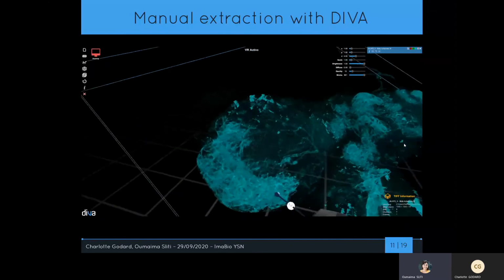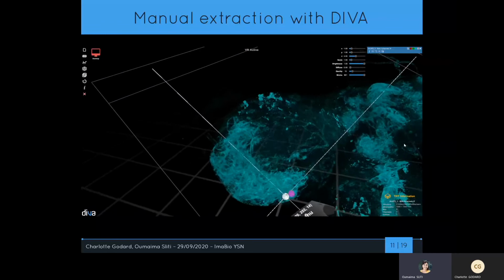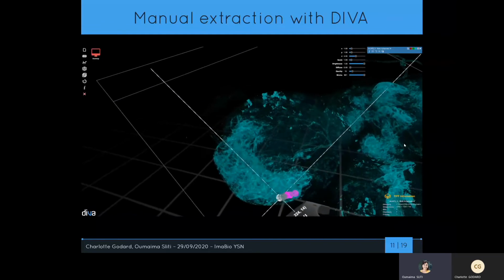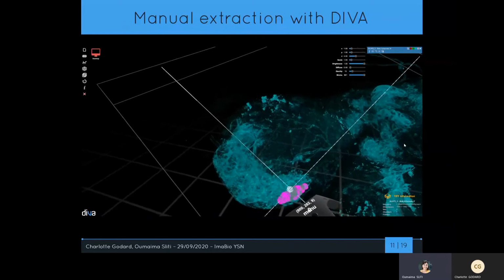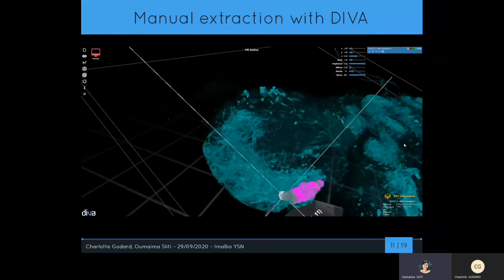I want to mention that I had difficulty with some samples to estimate whether 2 clones are connected or not. Some signals are too faint in parts, and the clones seem to have overlapping contours. And in most cases, we needed the intervention of the expert biologist.